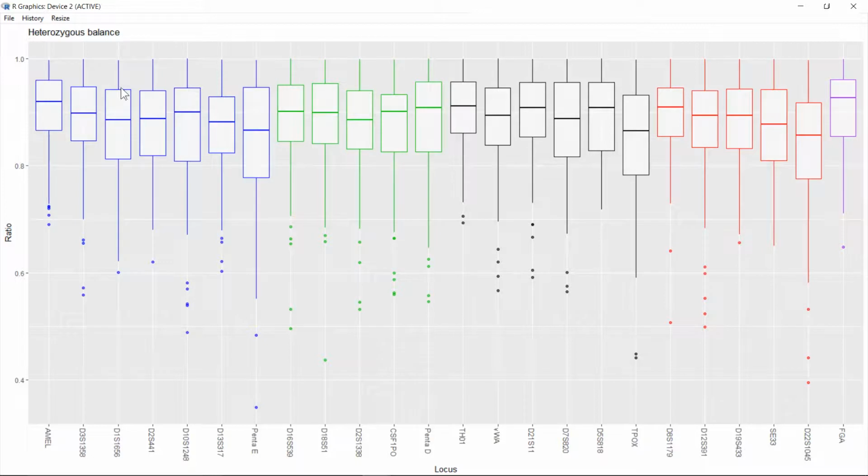Each of the Boxplot has 2 hinges, the upper and lower hinge, which represent the 25th and 75th percentile. The line in the middle is the median. The upper and lower whisker extends to 1.5 times the interquartile range, and all data observed outside this range is plotted individually as an outlier.